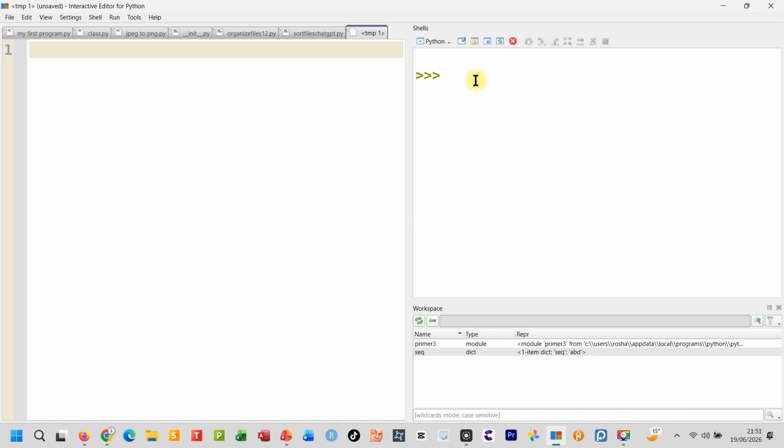Today we learn about designing RT-PCR or qPCR primers using Python. So let's begin.